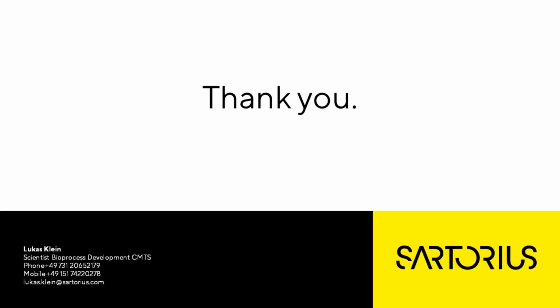Perfect. And is the Ambr 15 process scalable to pilot manufacturing scale? Yeah, I think this is a bit similar to the question we have had before for the process characterization. As said, in many cases we see that we get very reproducible results when using the Ambr 250 for the upscale. That being said, with some tuning of the Ambr 15, we can also get quite good predictable results at the Ambr 15 stage. However, there is some additional work needed for every clone that you need to scale up typically. So depending if you have a platform process or just a particular clone and how much time you invest, you can use the Ambr 15 or rather go to the Ambr 250 instead.